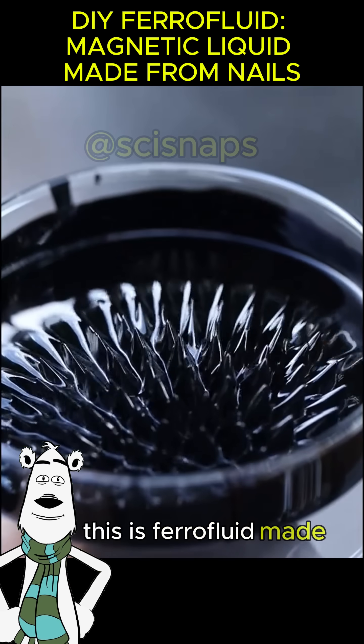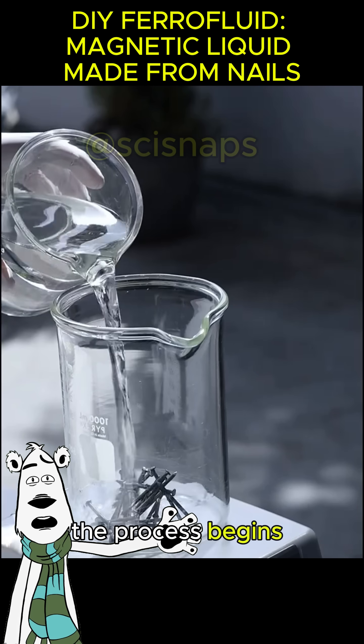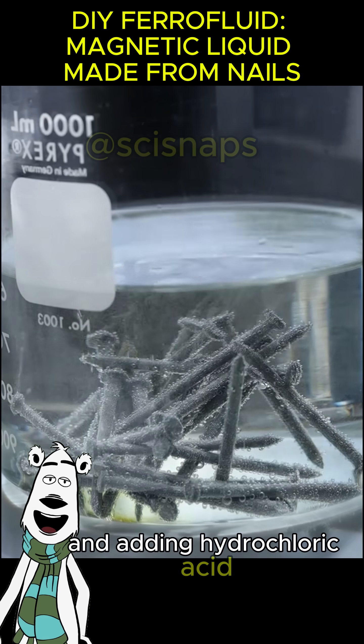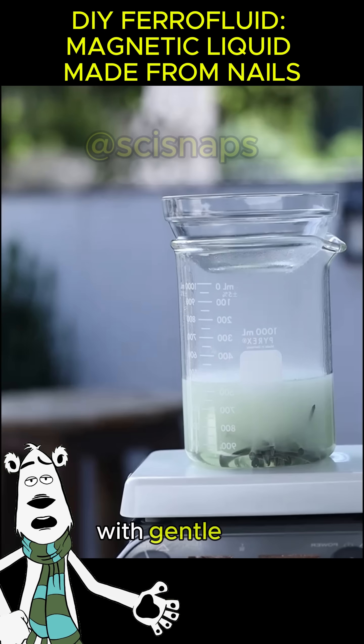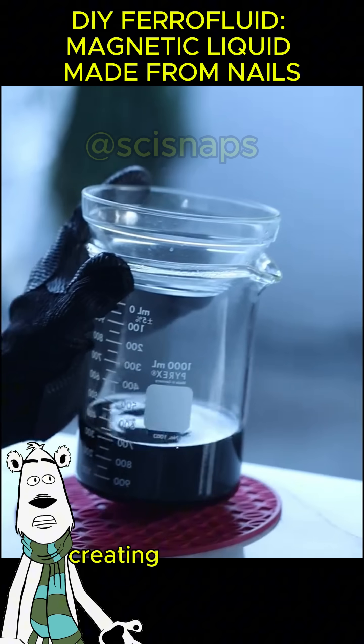This is ferrofluid made from ordinary construction nails. The process begins with placing the nails into a beaker and adding hydrochloric acid. Almost instantly, bubbles rise as the reaction starts. With gentle heating, chlorine atoms bond with the iron, creating ferrous chloride.